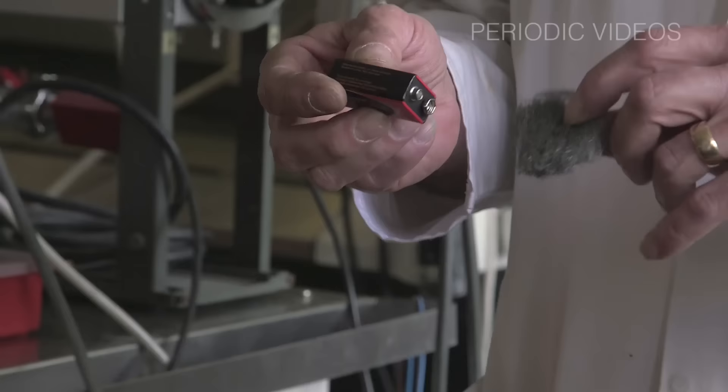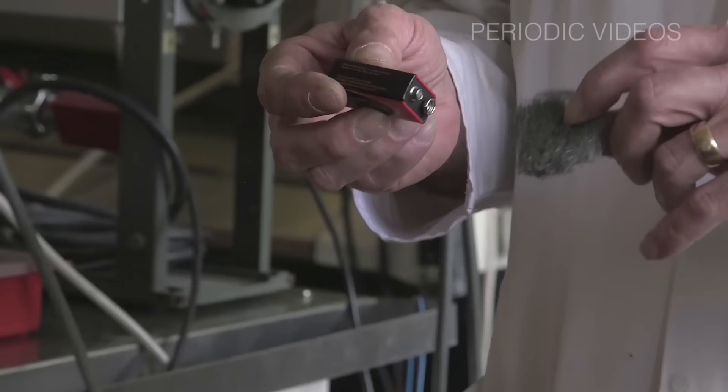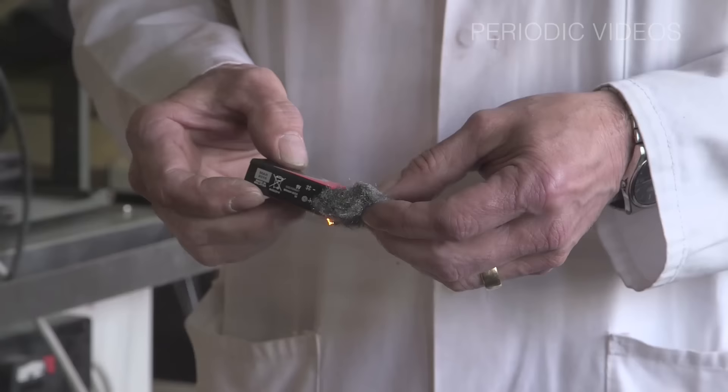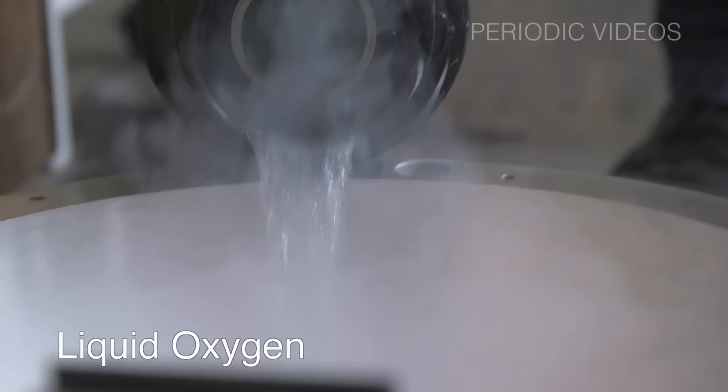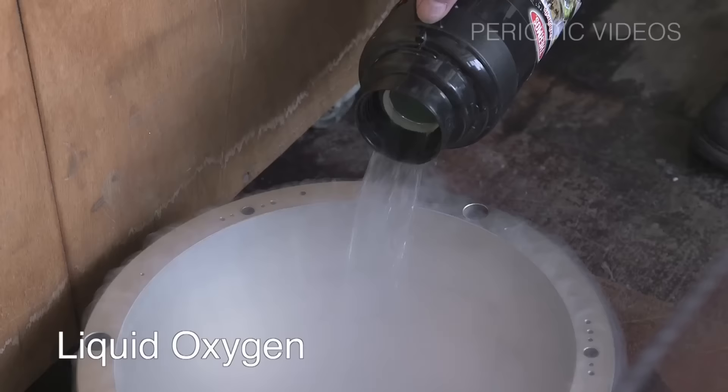So the experiment they decided to do was to drop a piece of burning iron wool. This is finely divided iron wire that looks a bit like my hair, slightly darker, and you can light such iron wool by putting it across the terminals of a small battery, and it glows red and you can see it burning in the air. Not very vigorously, but enough to stay red.